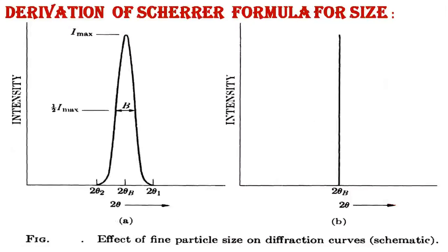So that diagram shows the effect of fine particle size on diffraction curves, 2 theta versus intensity.